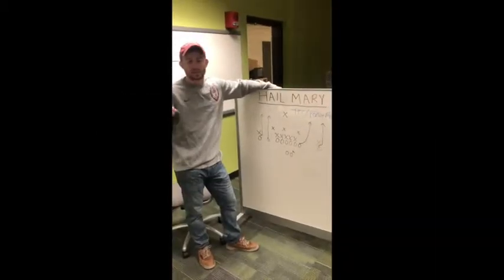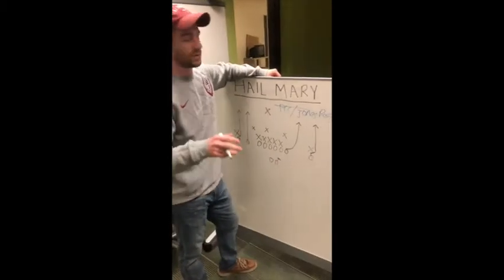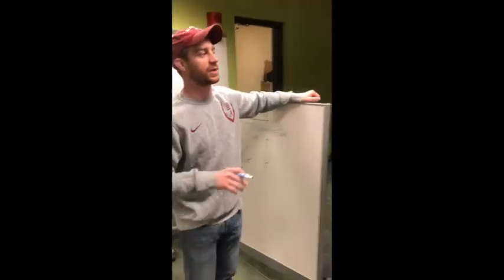Coach, what are you thinking? All right, here, bring it in. We've been running this play all first half. It's not really working. We're using PCC. We tried Jones reagent. It's too toxic. We've got to move to something a little bit greener.